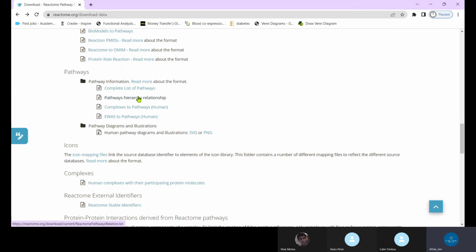This file you need to download. Once you download it, just open it and remove all the unnecessary entries and keep only human data.